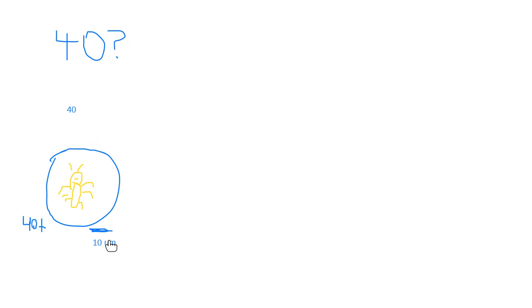So now you're like, how do you know that this is 10 micrometers? And I'll go, oh, I'm glad you asked. That's the part that I'm going to address now.